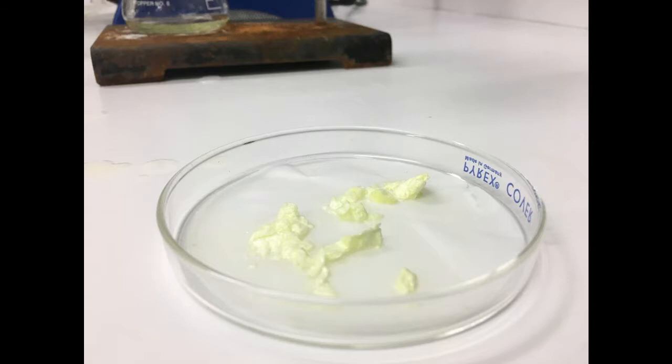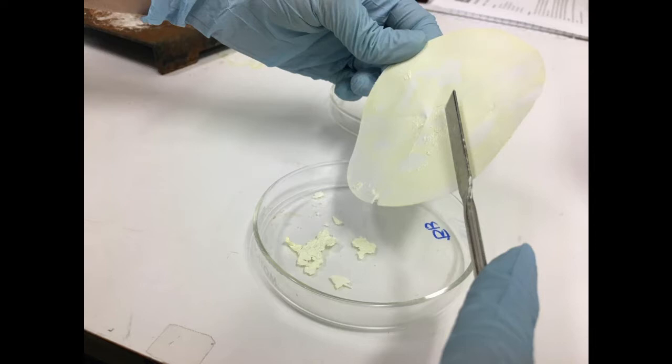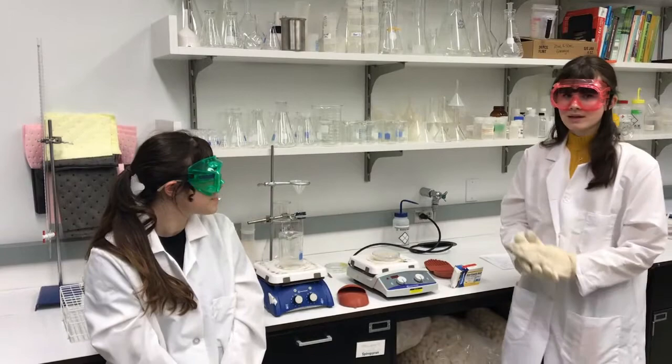Carefully transfer the filter paper into another beaker, or in this case, a petri dish, and you may let it air dry or use an oven. Finally, transfer the dried crystals of the caffeine into a petri dish for sublimation.